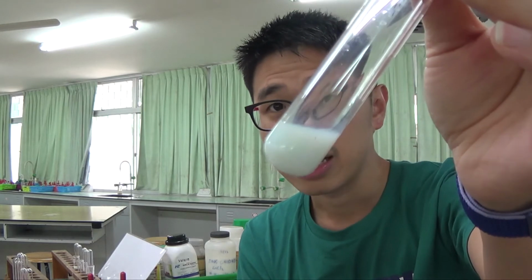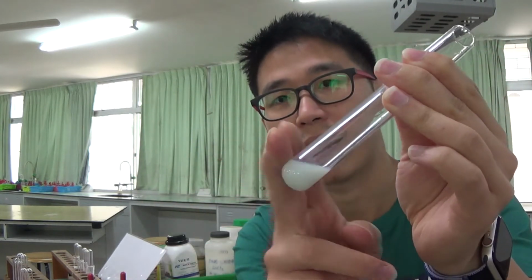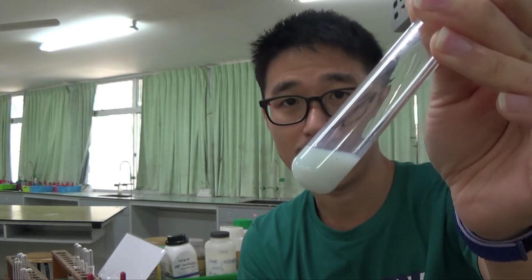So this can be asked as a question like, why is it difficult? Why are you not certain? Why can you not confirm 100% for sure that it's chloride? Because silver chloride is white precipitate, silver bromide is cream precipitate, silver iodide is yellow precipitate. The color itself might be affected by the color of the transition metal ion, which is still present. So this one looks white, but if my solution was quite concentrated with green, this one might look a little bit more green, but obviously it's not the chromium 3 plus that precipitates out with the silver nitrate.